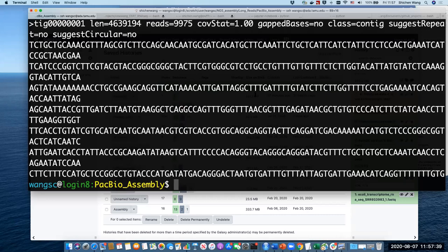So you see the power of a long-read assembly. It actually can give you a whole genome scale assembly if the genome is not big, of course. I mean, 4.6 MB is really small. Sometimes, like the rice genome is small, but it's already 300 MB or something.